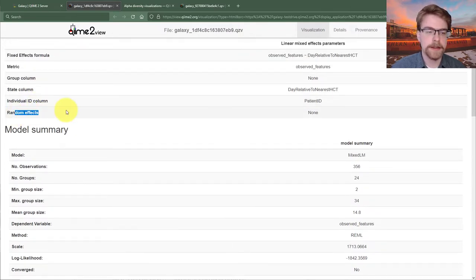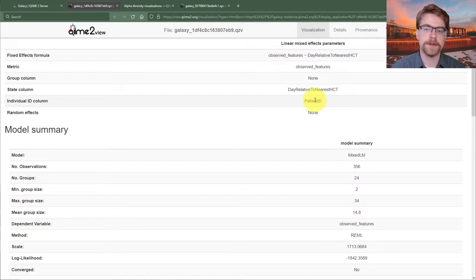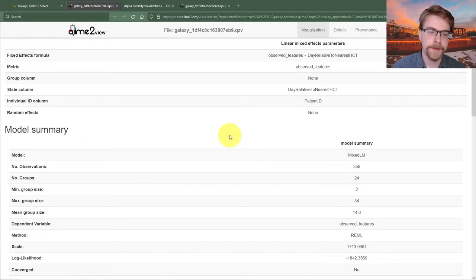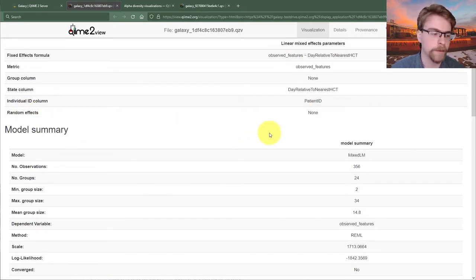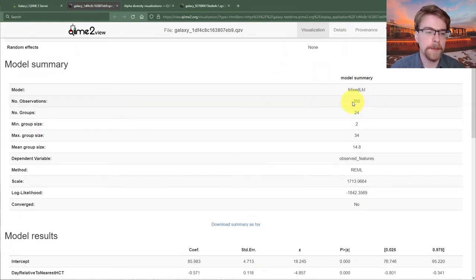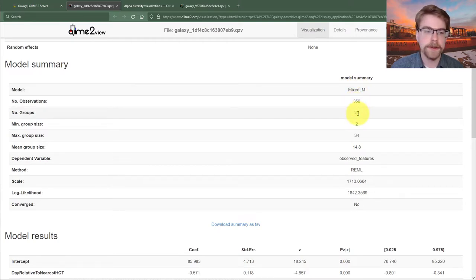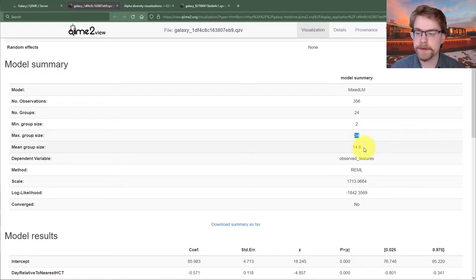Note that the output says 'random effects: none' — that isn't actually true. If you read the help text, individual ID columns are automatically added as random intercepts. That field would be for additional random slopes or more random intercepts. Our model summary shows 356 samples, 24 groups — that's 24 patients. The smallest group had only two samples; one patient had 34 samples; on average they had 14 samples each.